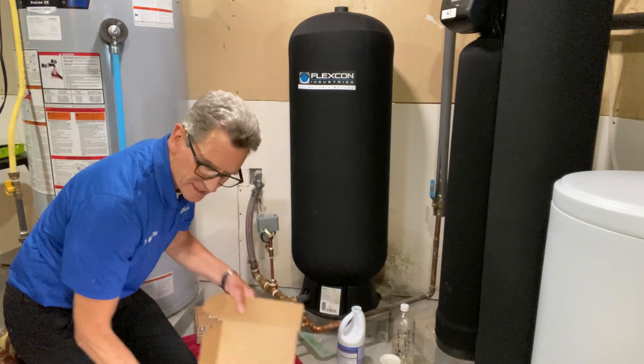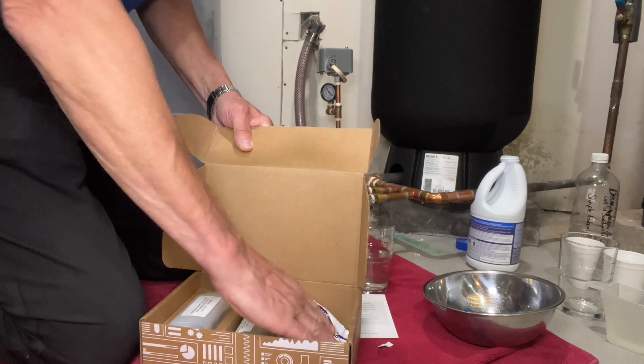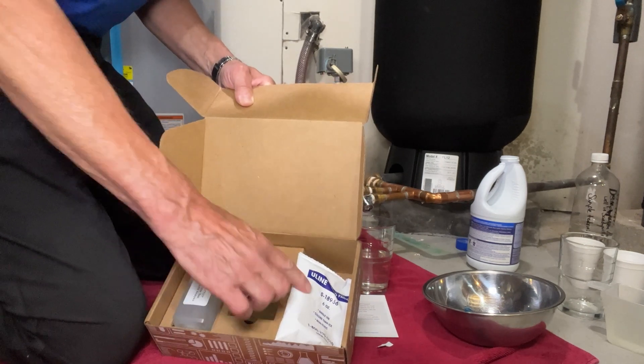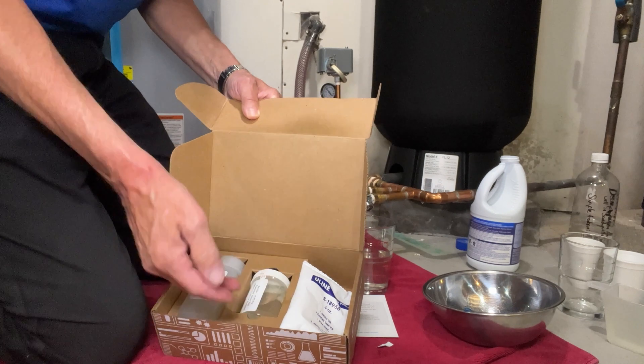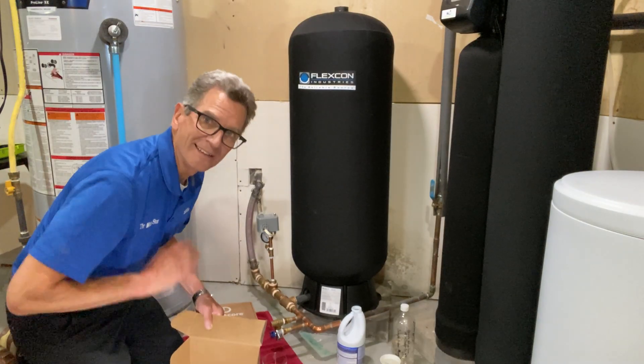Put everything together in your kit. The freezer pack goes on the side closest to the small bottle. Make sure the bottles are sealed up tight, then complete the documentation and take it to the post office.